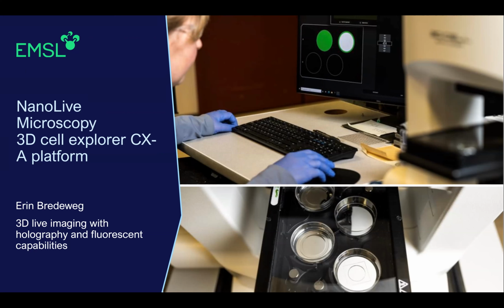It is particularly strong in that it is able to image parallel samples and up to 60 replicates or different conditions at the same time.